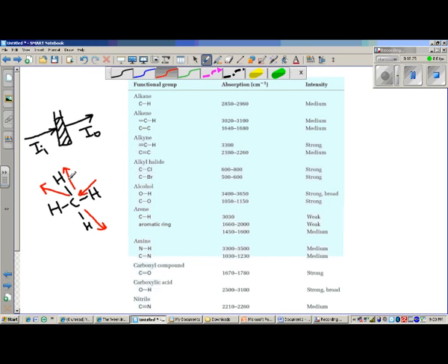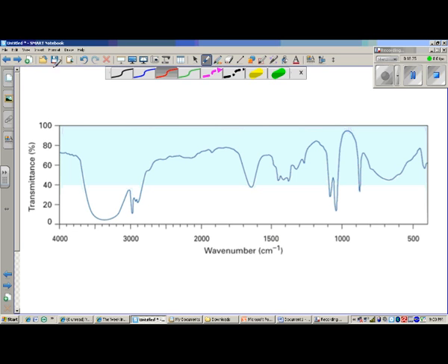these are molecular absorptions of energy and cause the energy going out of the molecule to be less than what came in. And so what happens is, here's a sample infrared spectrum. Transmittance is essentially the percentage of the light coming out versus the light that originally went in. And if you have close to 100% transmittance, as we do at this particular point, then that means that the amount of energy going in is approximately the same as the amount of energy coming out, therefore very, very little is being absorbed by the molecule.